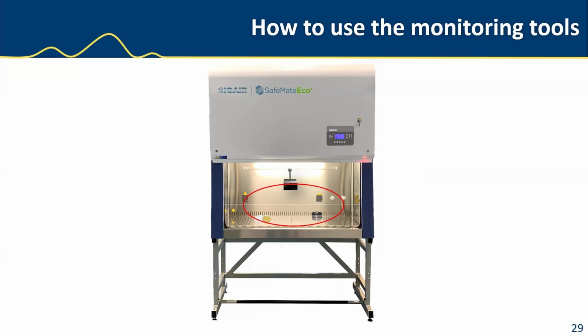By the actual technology of the biological safety cabinet, you'll have a window that comes down, a sash window that's adjustable, but you'll also have the ability to stick your arms in. There's also a positive barrier developed with the airflow coming down, so it's stopping any contamination from the environment outside of the cabinet getting in, and it's also preventing anything from that critical environment getting out. So there's two methods of activity going on where the operator is being protected and the product's being protected from the environment.